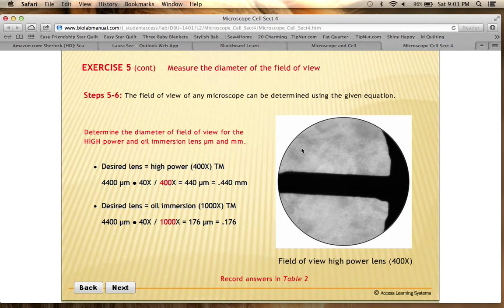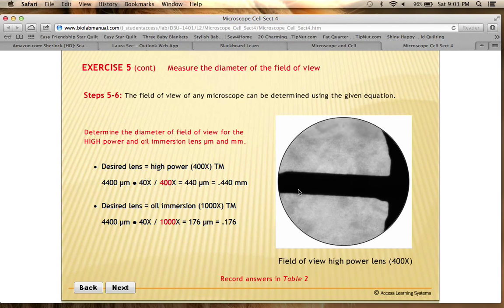Looking at this E zoomed in under the high power lens, what you can see across the diameter of this circle is 0.44 millimeters, or 440 micrometers. That little cross section of the E is basically 0.44 millimeters long — so that's what you're using as your gauge here.